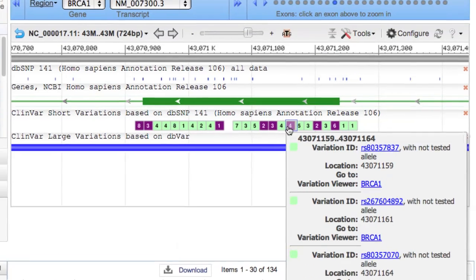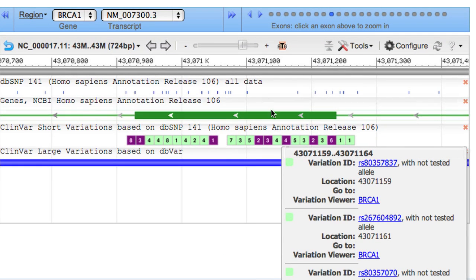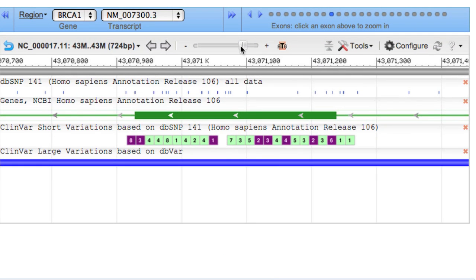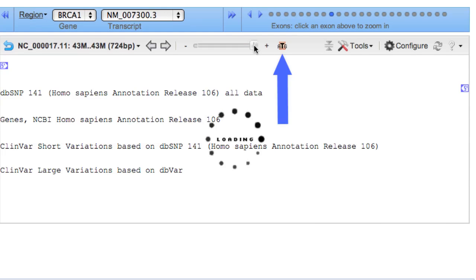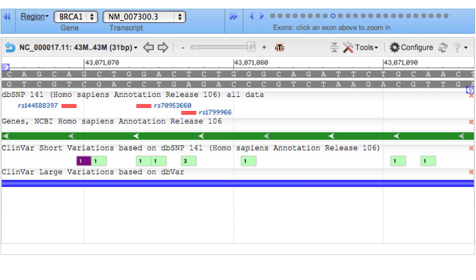You can zoom all the way to the sequence level using either the slider or this ATG icon. While we're here in the Sequence Viewer, a nice feature is the ability to set a marker and get the coordinates in genomic, transcript, and coding numbering systems, including HGVS.